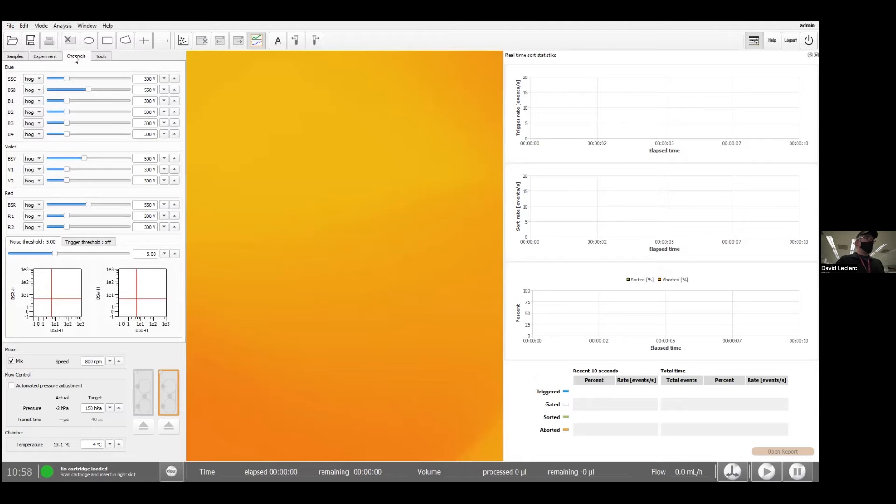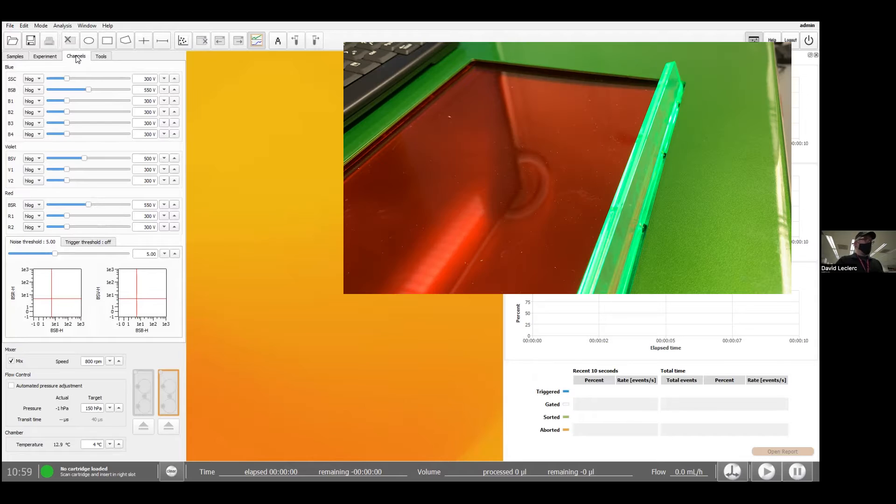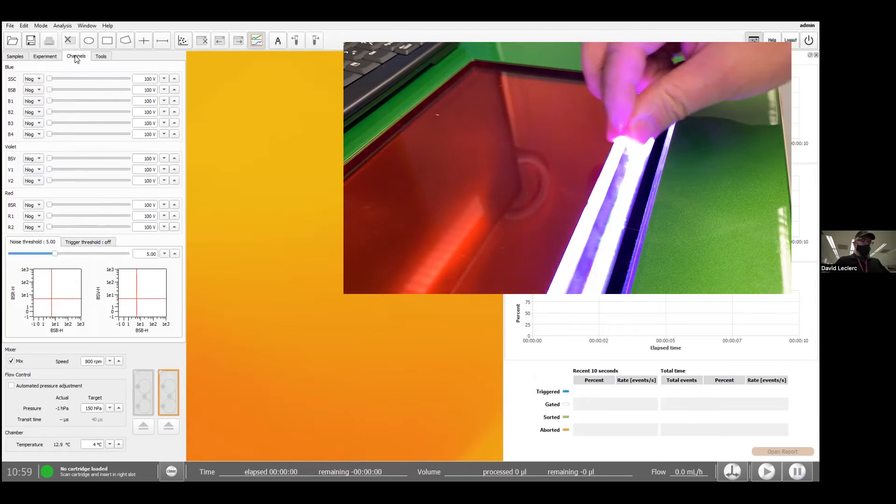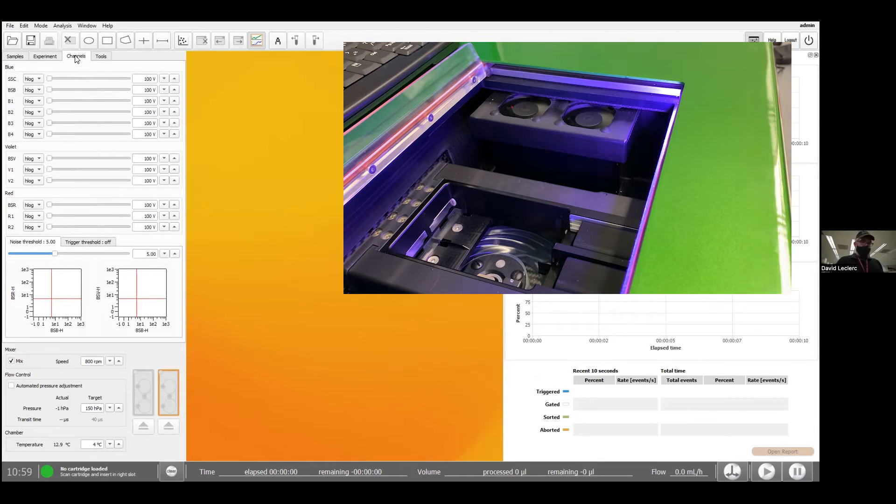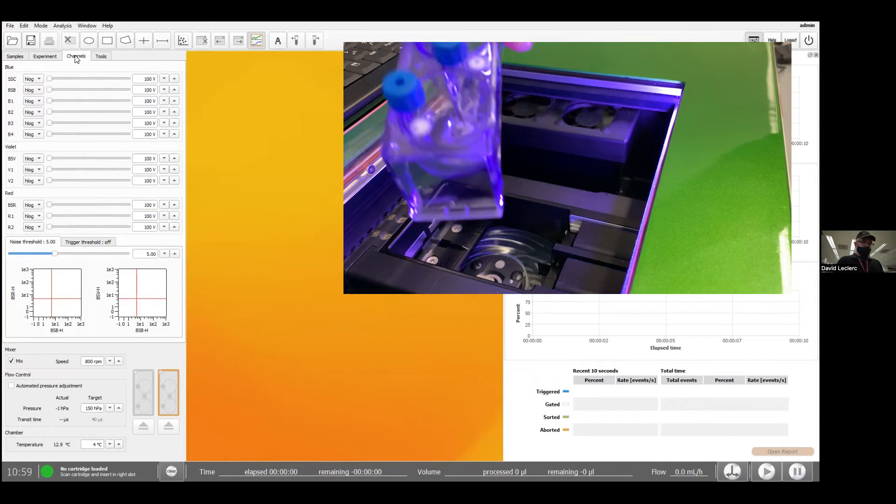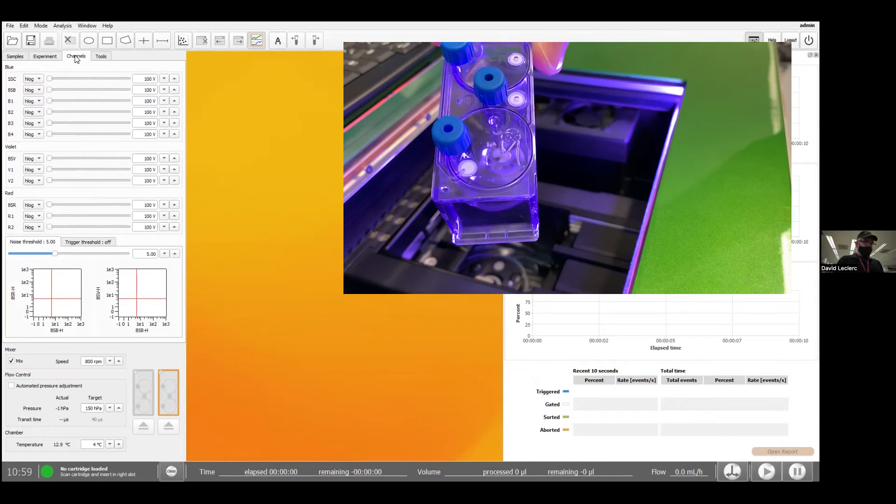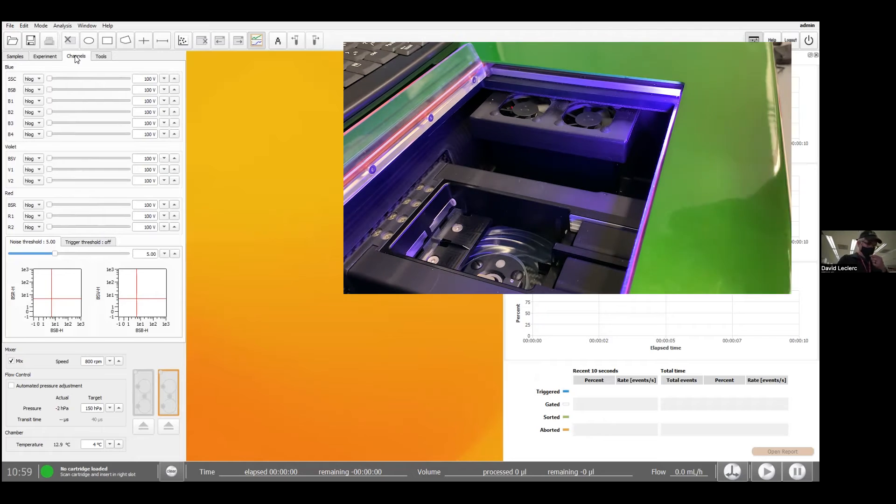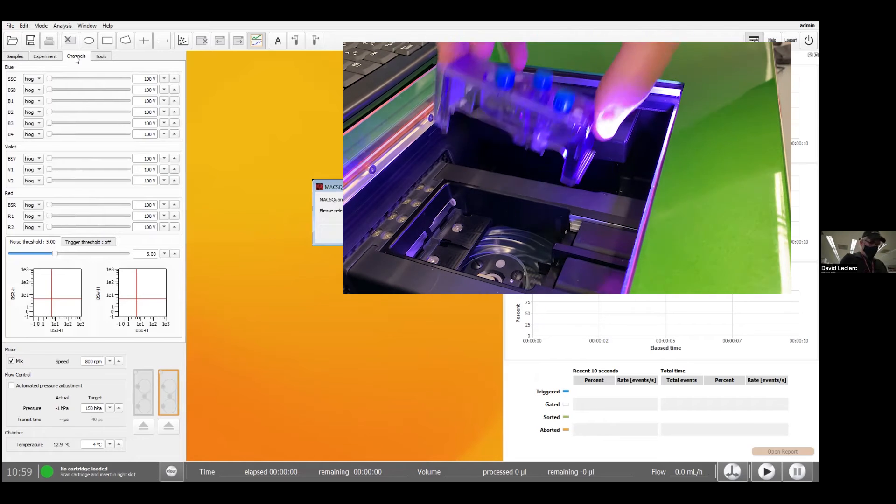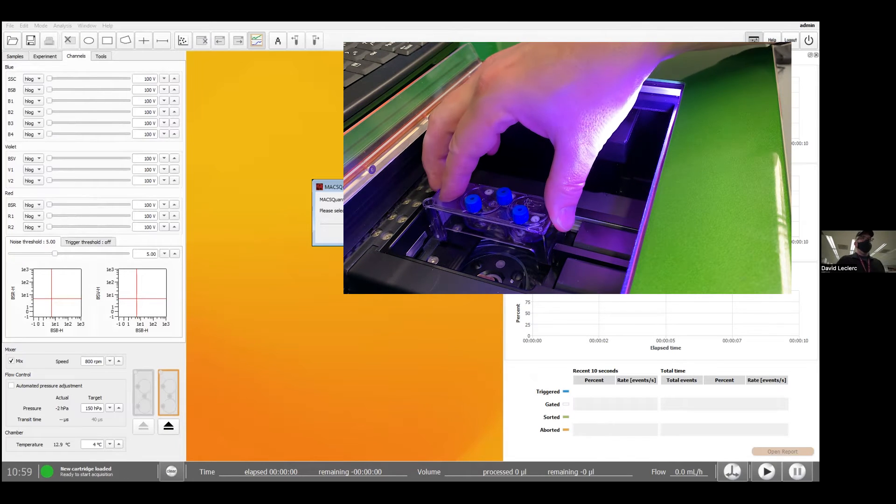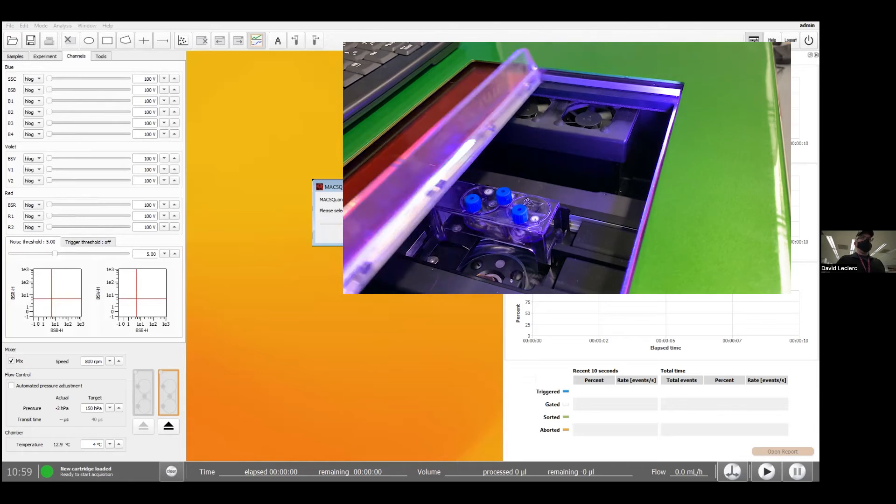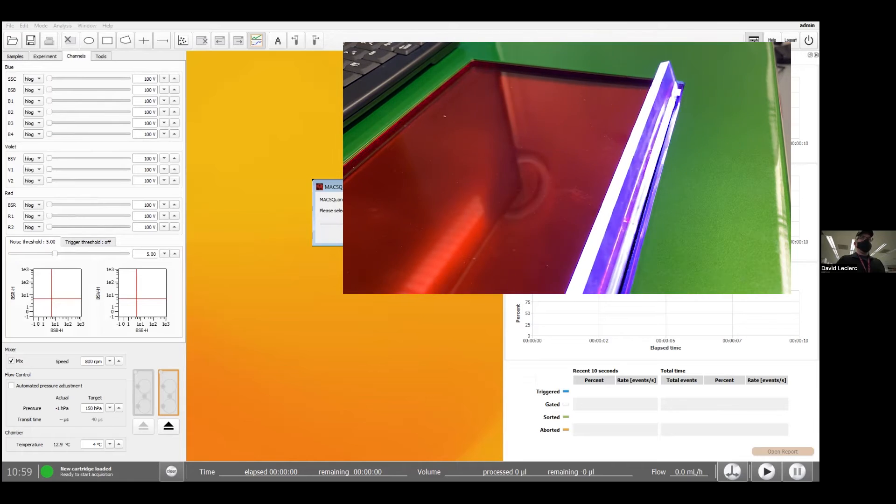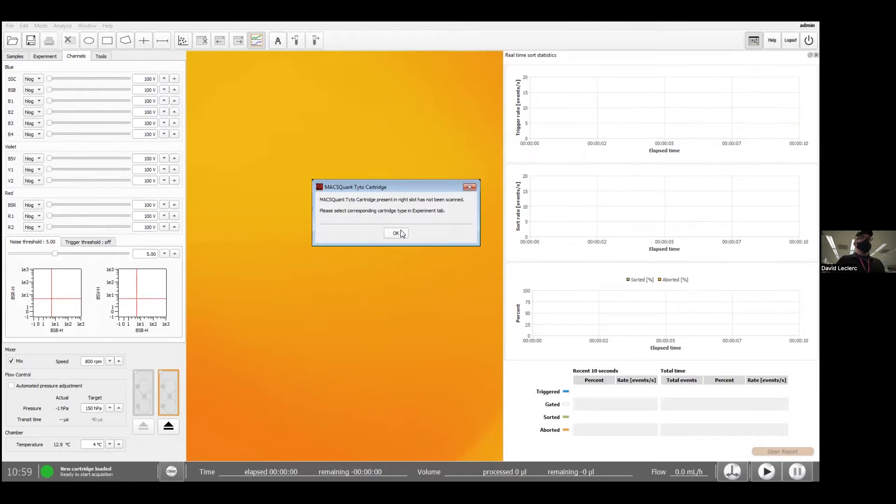I'm going to go to channel next. Now I'm ready to load the cartridge. So essentially, I'm just going to push the panel here and load the cartridge. Keep in mind the owl should be facing you. You could either scan the cartridge or just load it in and click OK over here.